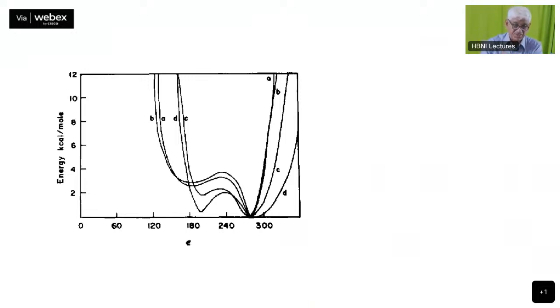So you have the energies, and all the torsion angles are allowed from 0 to 360. This energy calculation has been done here to see the possibilities of various values for the epsilon torsion angle. It turns out that epsilon is equal to 180 or 270. This is the minimum energy conformation. For others, the energies are very high. So it is very unlikely that you will populate any of these values. So mostly you will either have 180 or 270.